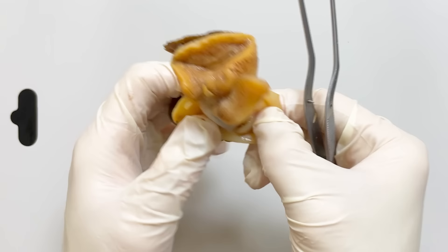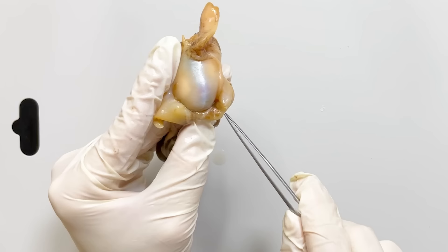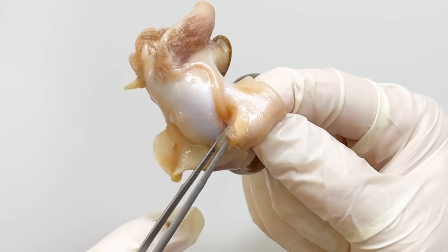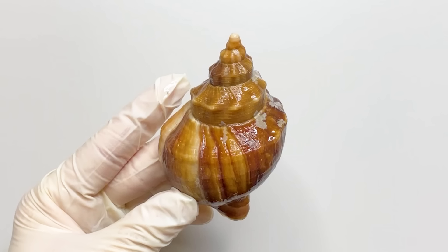Flipping the upper part of the head reveals the anus. Pressing gently, you can see feces being expelled. The reason the anus is located towards the head is due to the coiling of the body inside the shell.